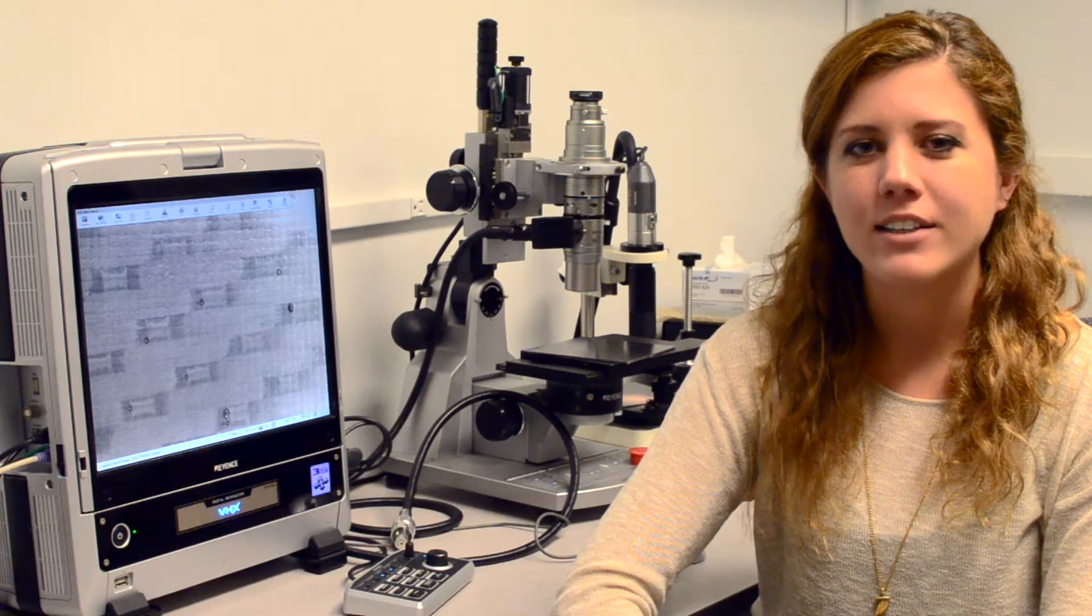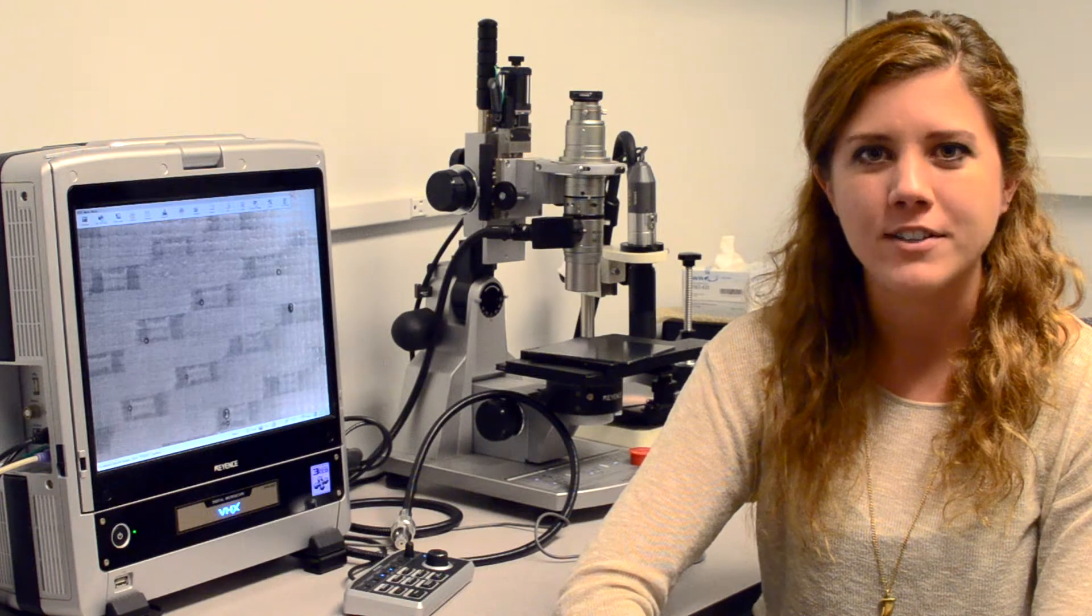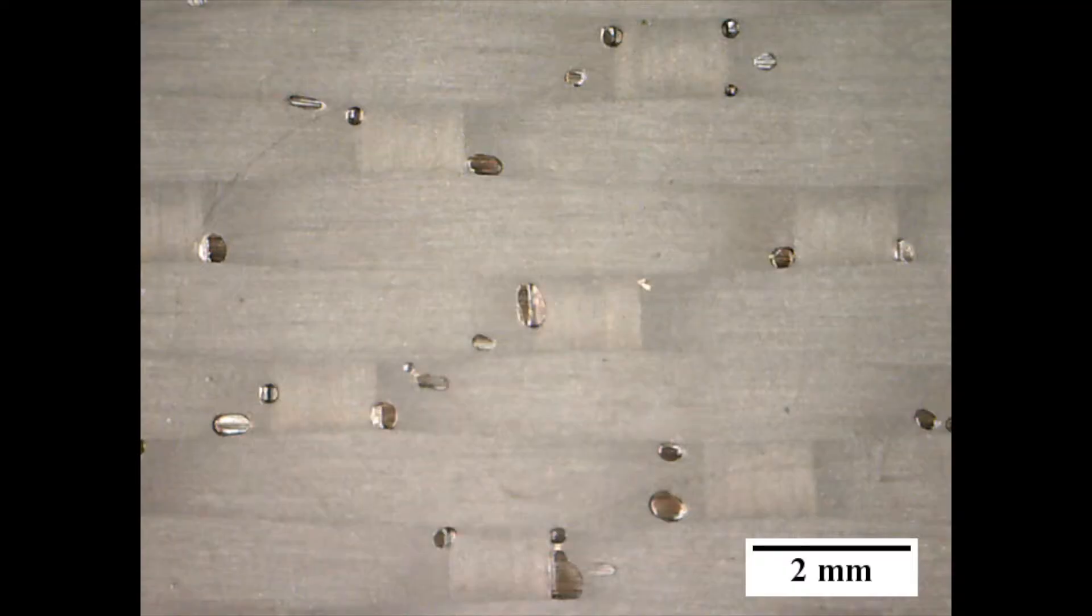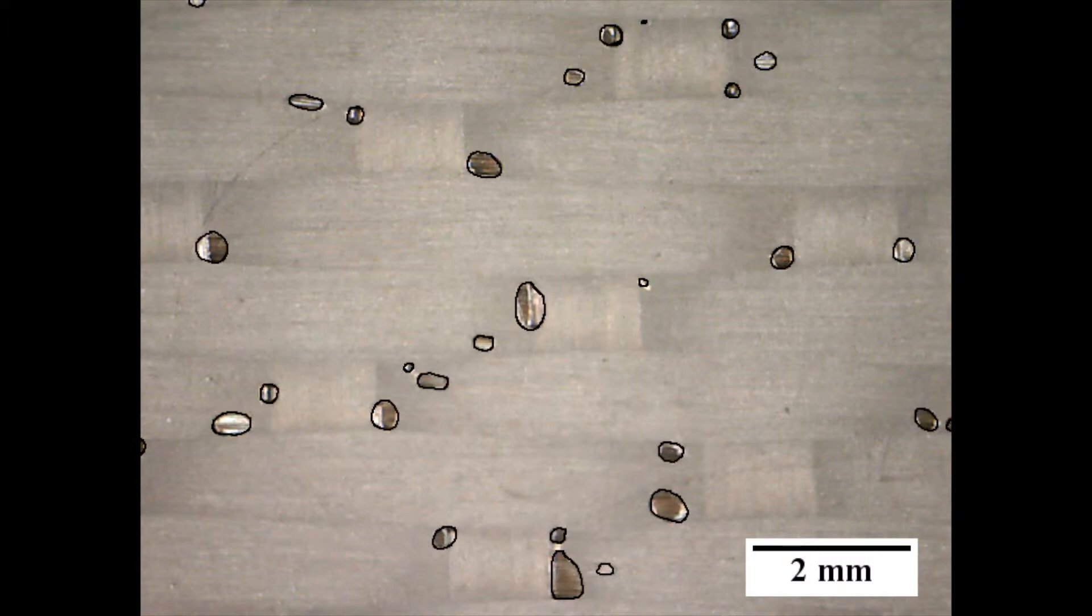Surface porosity can be quantified using a low magnification optical microscope like this one here and an image analysis program. We found that the best way to quantify surface porosity was to take a raw image of the composite surface, manually circle each surface flaw, then convert the color image into a binary one where surface porosity is indicated by black pixels.